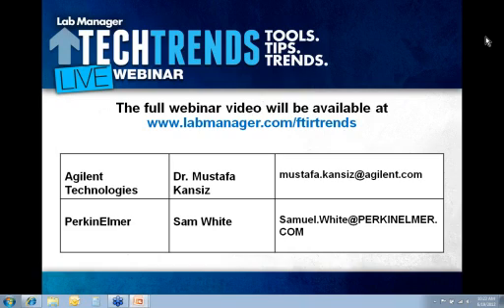The real problem with Raman is to do it right, you're going to have to spend some money. In the United States, that would be about $100,000, where you can get a mid-infrared to do that for under $20,000. So Raman is still trying to find a place. There are certain applications that are traditionally used. Polymorphs, for example, in the pharmaceutical business are generally done by Raman, but they can be done most of the time by mid-infrared.